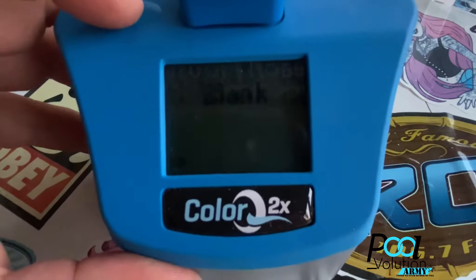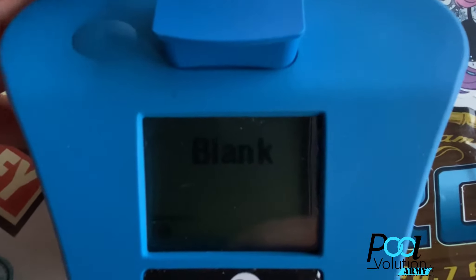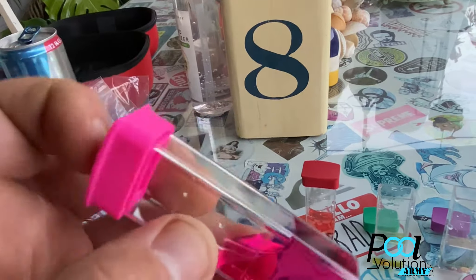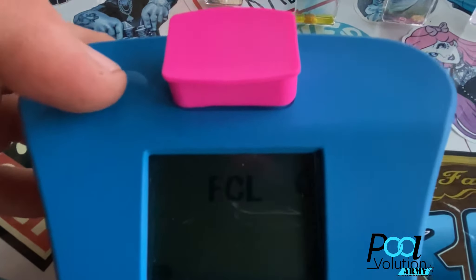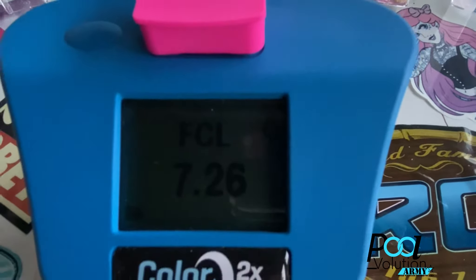Once you turn it on, hold the button down for a second or two and it'll say 'blank.' Insert the blank vial, hit the button, and it does a calibration of the blank vial. Once that's done, it moves right on to free chlorine. Take the free chlorine vial, invert it three times, stick it in the photometer, hit the button, and it will give you a free chlorine reading.